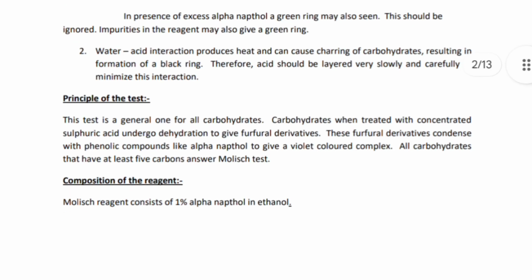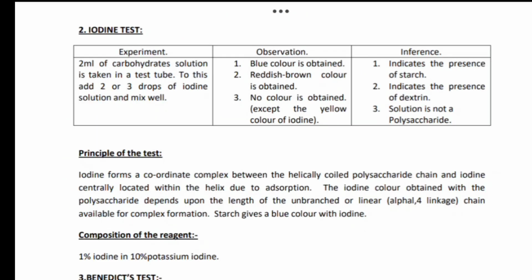Composition of the reagent. Molisch reagent is 1% alpha naphthol in ethanol. This can again be asked as a viva question.